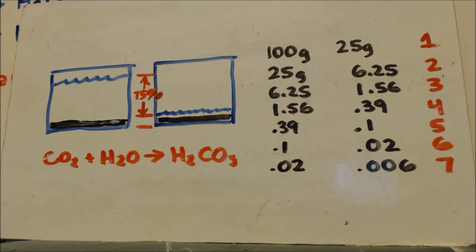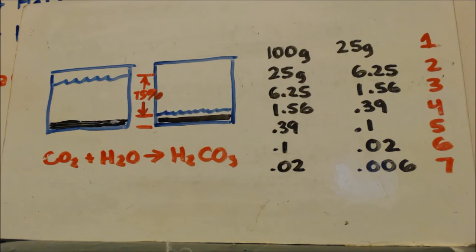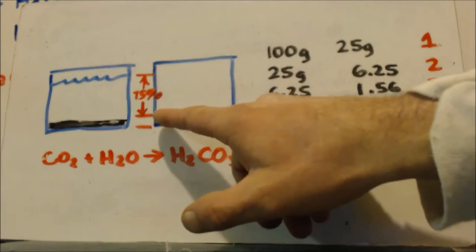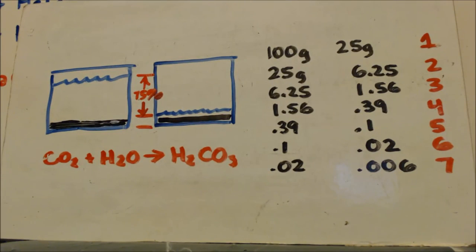And during that time, because it takes so long for it to settle, the carbon dioxide goes in and out of the water, and it basically just makes the H2CO3 and converts the hydroxide to the carbonate by the time I'm done, right? Now when I get done doing this 5 or 6 times, I'll let this be wet, and I will just throw it in the oven, or put it on a radiator or whatever, and dry it up. And that's basically it, how you make a carbonate.